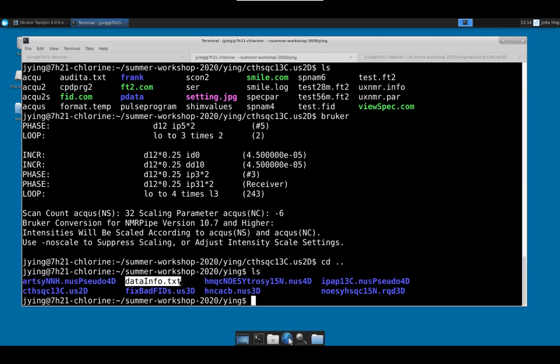So I'll let you know when you can run. Okay. The other thing is that if you want to run it, you might want to rename the directory for the data so that if it gets overwritten, you can get that back quickly. So the first experiment we want to show is this constant time. So go to my data directory.